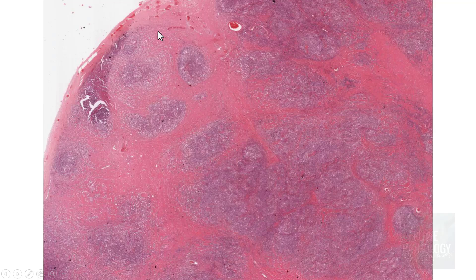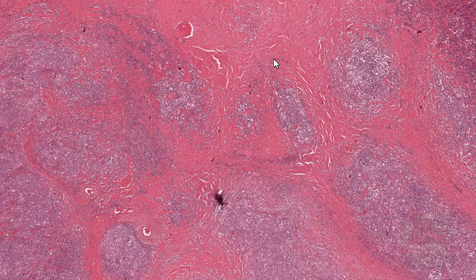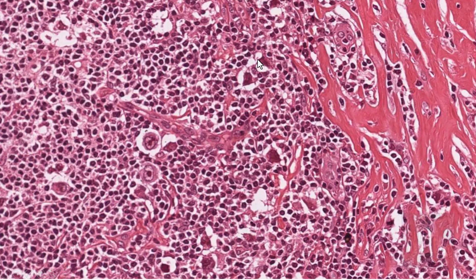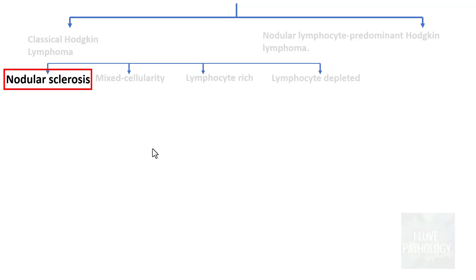Looking at the nodular sclerosis histology — the collagen forms bands within the lymph node, dividing it into small nodules. The lower-power view shows the collagen bands and nodules of lymphocytes along with characteristic Reed-Sternberg cells. You can see the lacunar spaces around these cells, including the mononuclear variant with prominent eosinophilic inclusion-like nucleoli. This is very typical of nodular sclerosis type Hodgkin lymphoma.